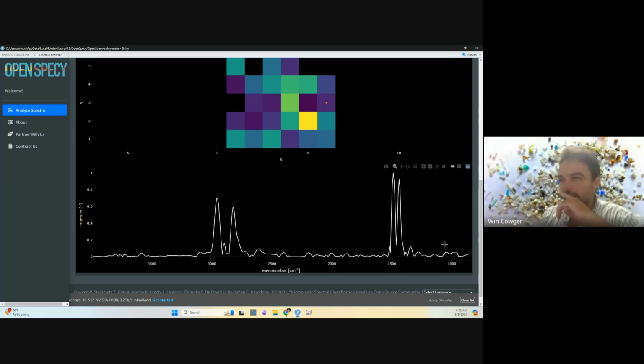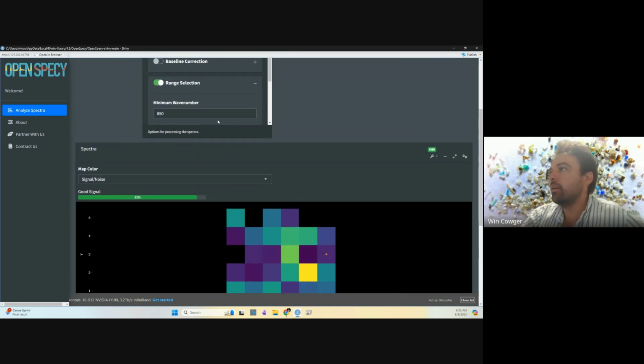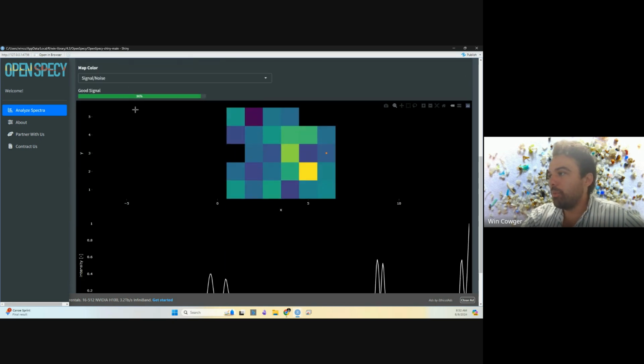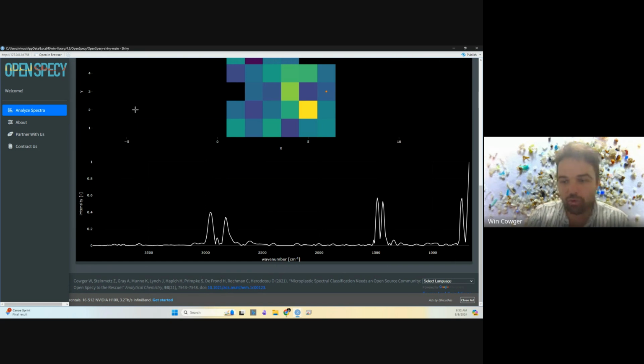I do think I'm thinking now that actually is part of the polyethylene peak, because they have two peaks in the lower region between 2,000 and 500, and I think we just may be on the cusp of the second peak over there. So I'm not gonna remove that one, but that's another common artifact that you'll want to be looking at in your spectra to make sure that you're not having that issue.